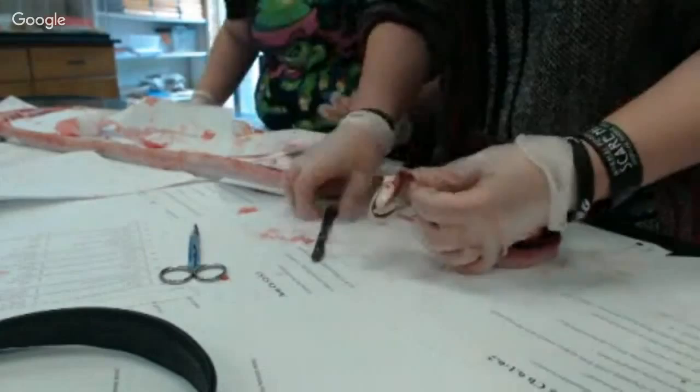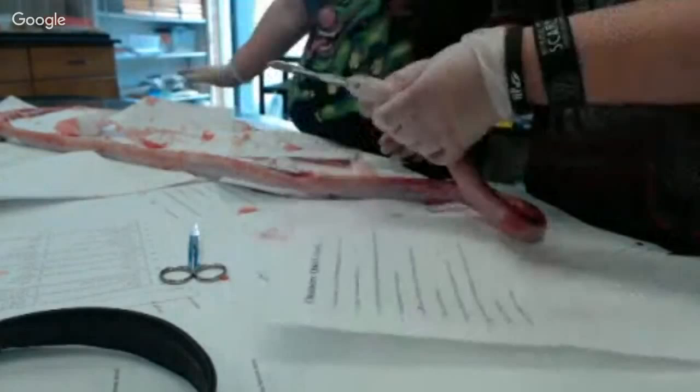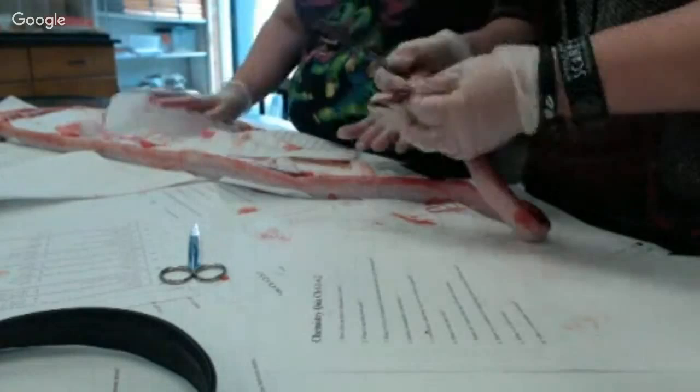Do you know that their tracheas actually go all the way to here for when they eat? A lot of snakes can stick it out. I'm done being sad about this. It's kind of actually really cool. It's quite interesting, yes.